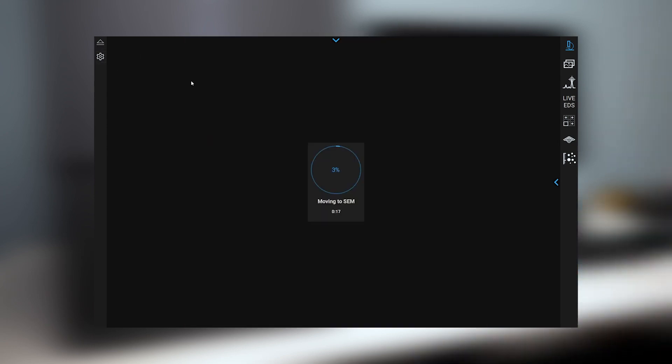You zoom into the sample area of interest and proceed to select move to the SEM option. We'll have a brief timer here to switch imaging modes while a diaphragm pump establishes the correct vacuum level. During this time the sample is moved underneath the electron beam.